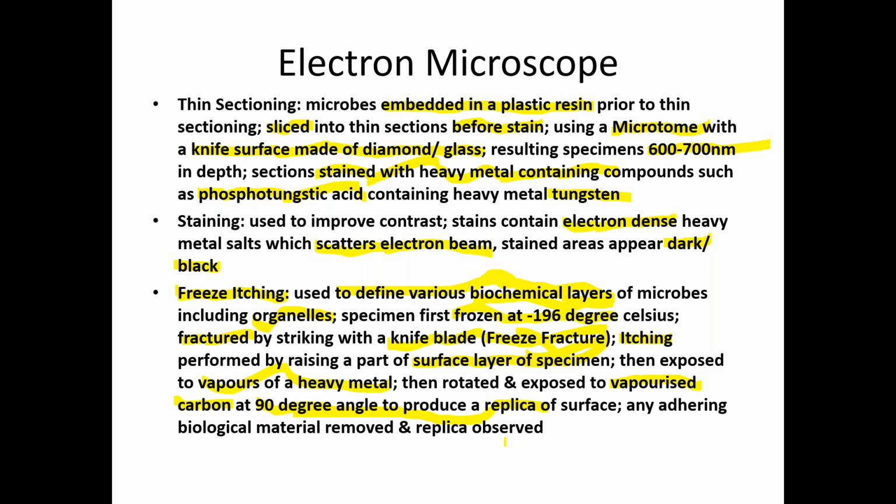When striking with a knife, the cell will not get damaged? No, it's not like that, because even though it is written that it is fractured by striking with a knife blade, the purpose is to produce thin sections of the specimen. Like how I explained in thin sectioning, we are slicing it into thin sections. Here also, even though we are striking it, fracturing means making it into portions, similar to thin sectioning.